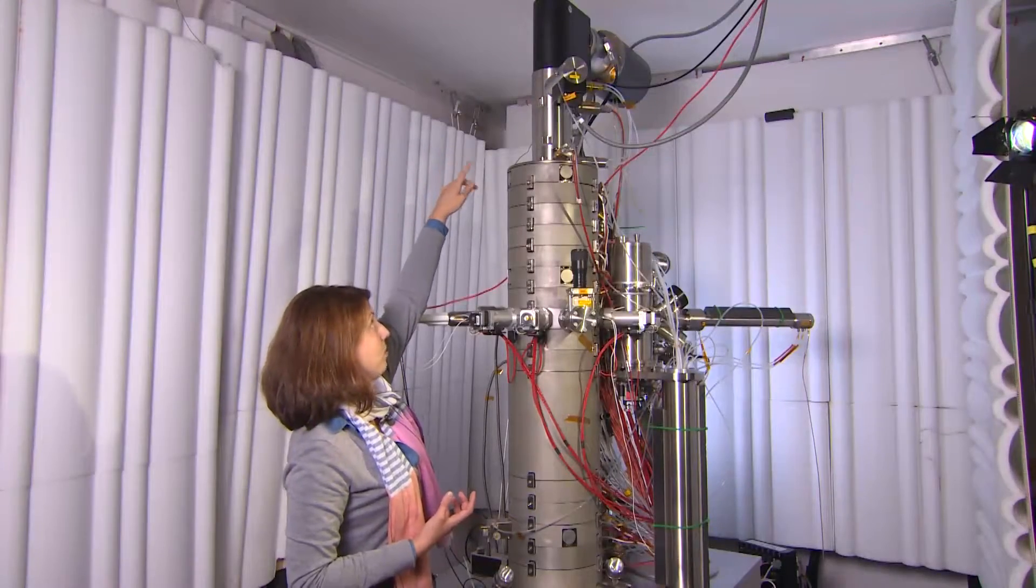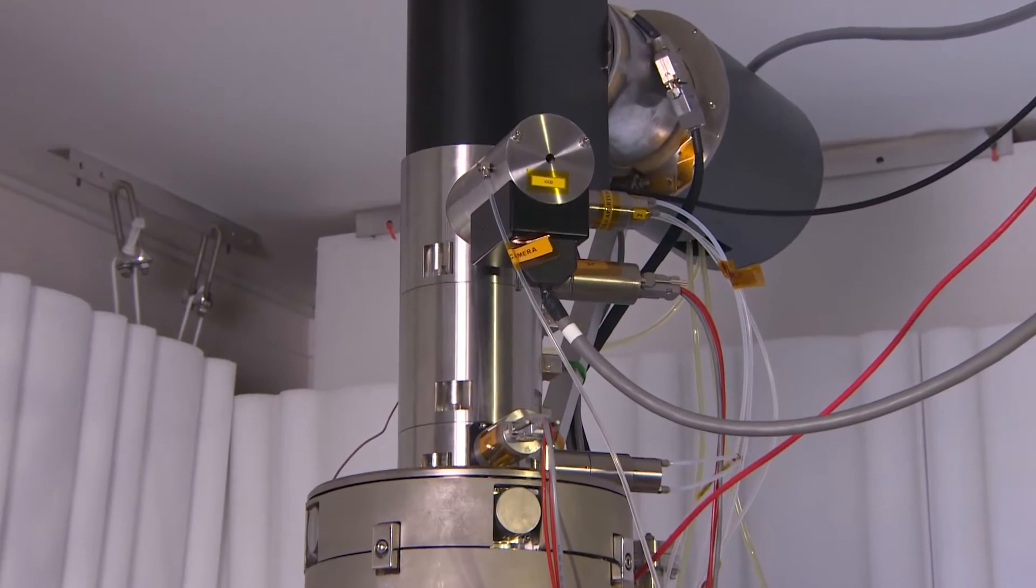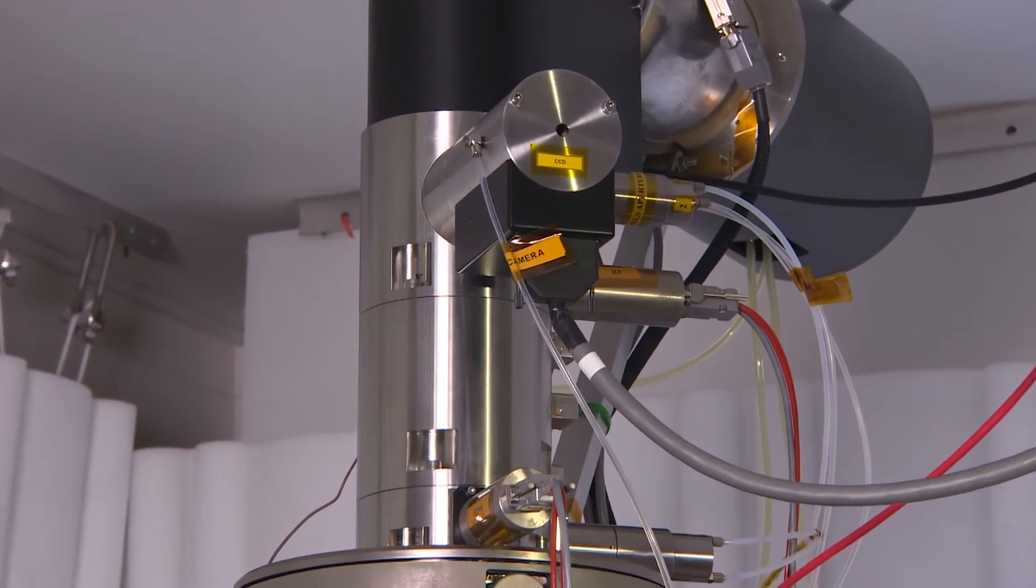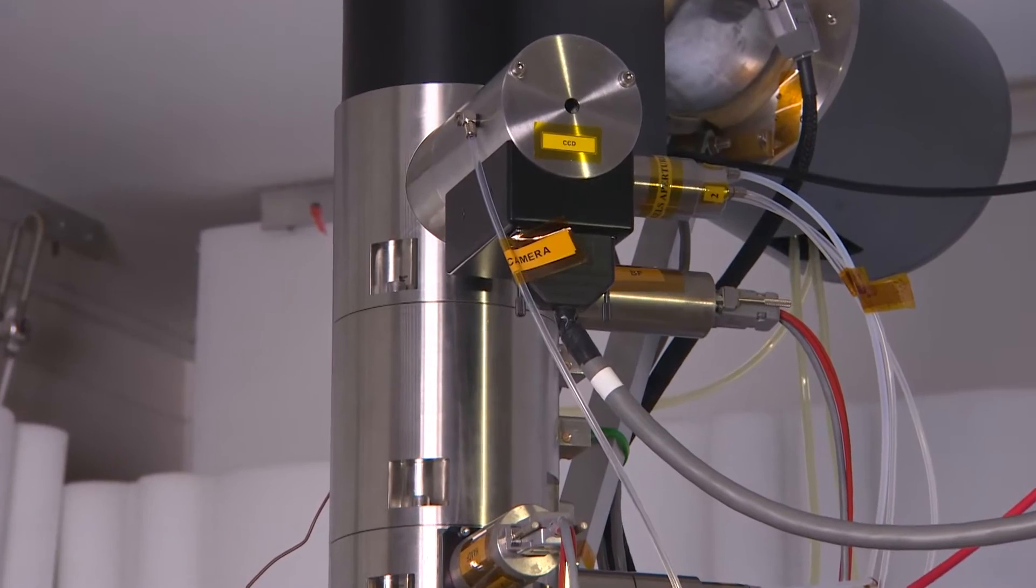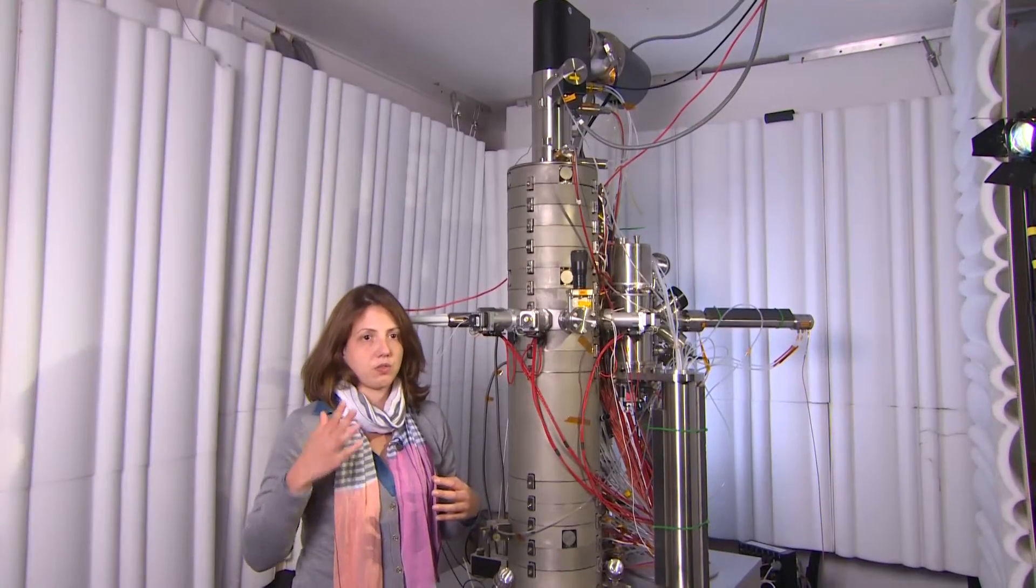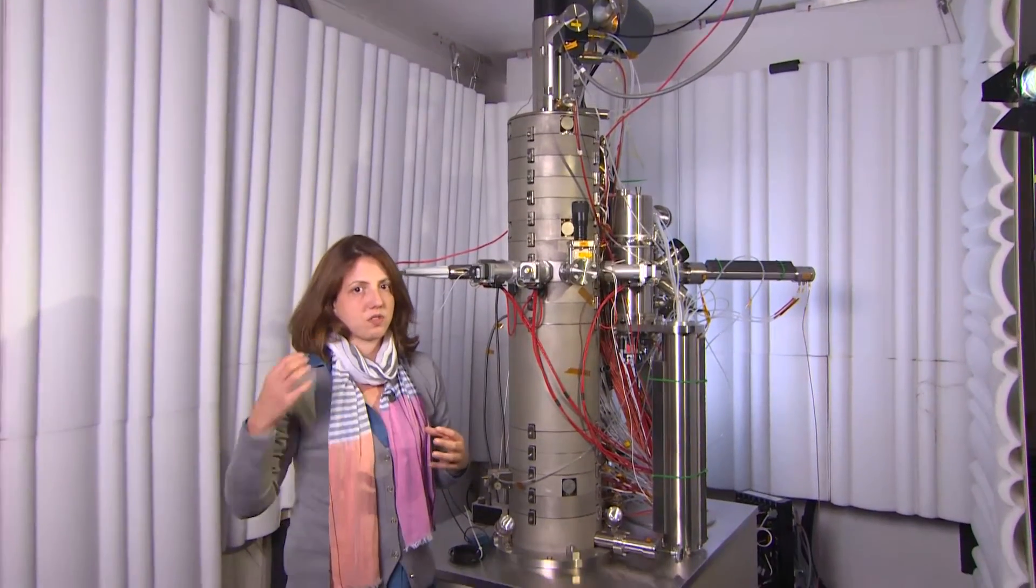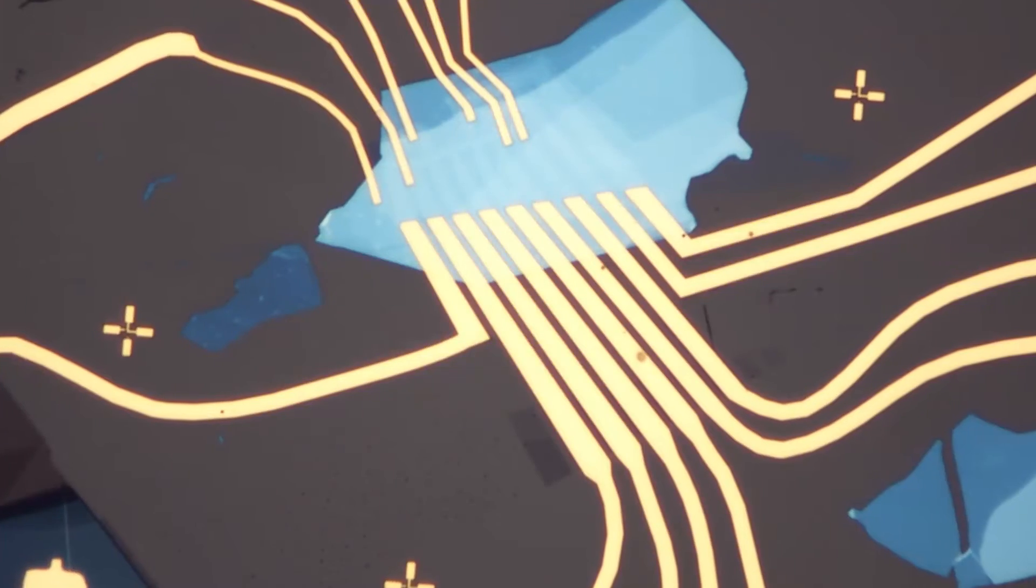On the top of the microscope you have what is called an electron energy loss spectrometer which collects electrons that have lost energy going through the sample, and this gives us information about the electronic structures of the materials we are looking at.